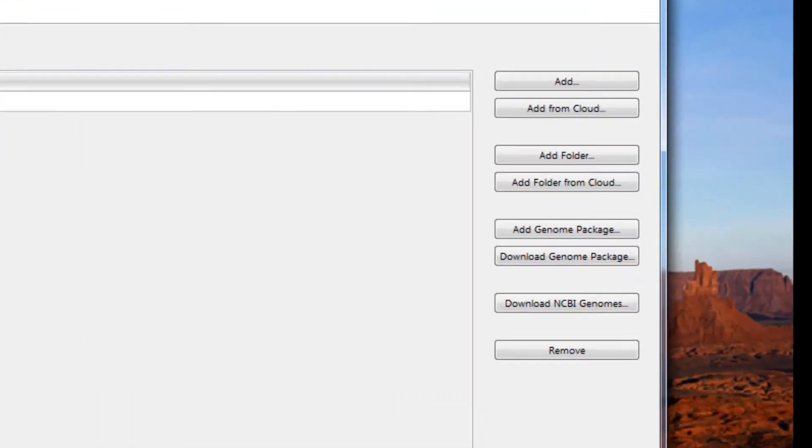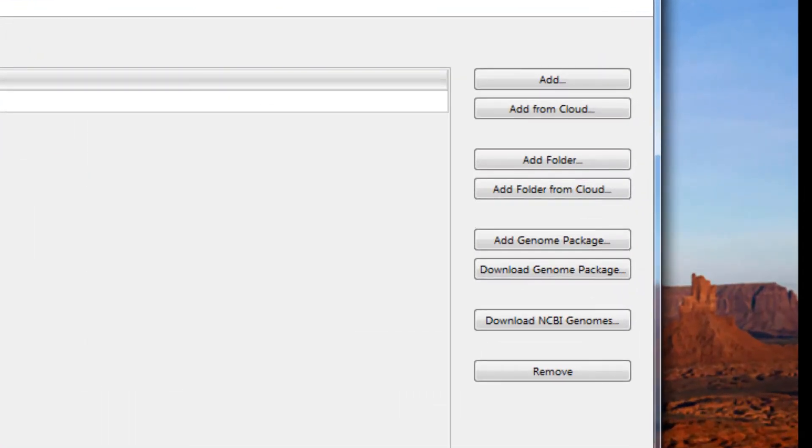Here, you have the option to download the genome package that is hosted on the DNA Star website or you can download a reference genome from the NCBI genome database.